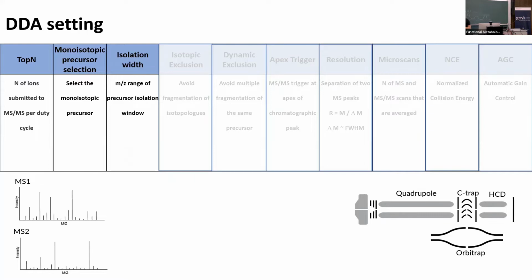And there, I think Bruker may have made a really cool TOF instrument, but at least the maXis we had available in San Diego did not have a very good quadrupole filter. So by default, you would need to use that with, I don't know, 5 or even higher isolation width in order to get enough ions in for an MS-MS experiment.